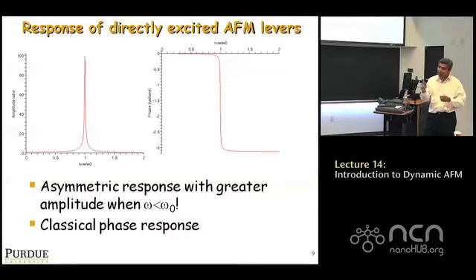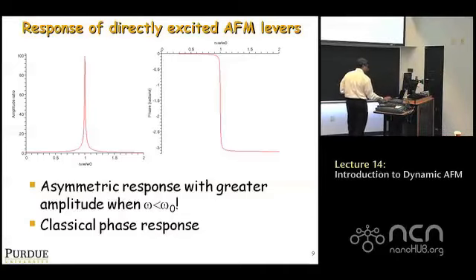If you do the simple calculations with the tuning curves, you get a feel. Oh, this piezo shaker is shaking it by an angstrom or 2 angstrom. You have these numbers that give you some confidence. If it's just in volts, you don't know what you're doing, right? So, okay, this is important. The way you excite it makes a difference to the tuning curve. Okay.